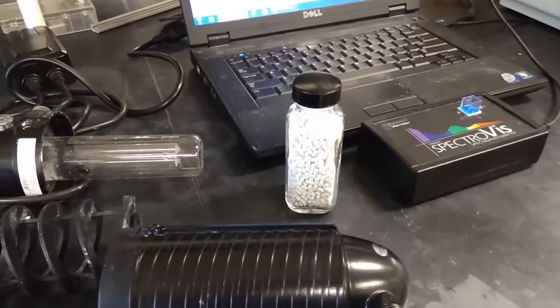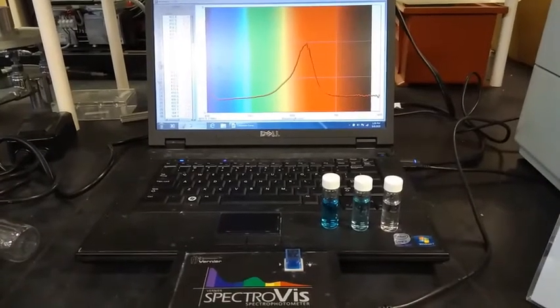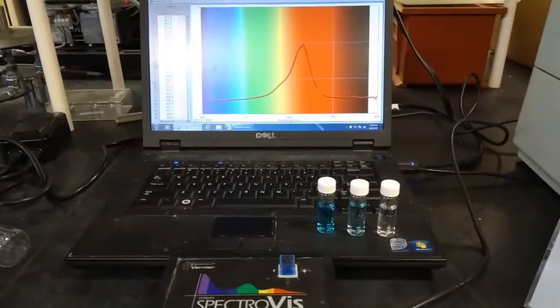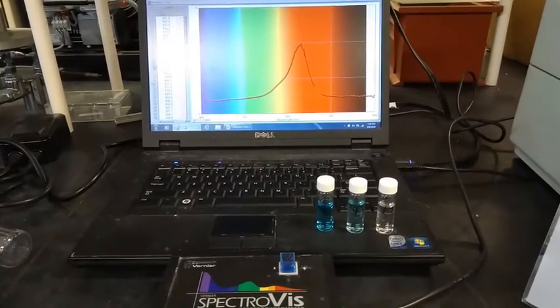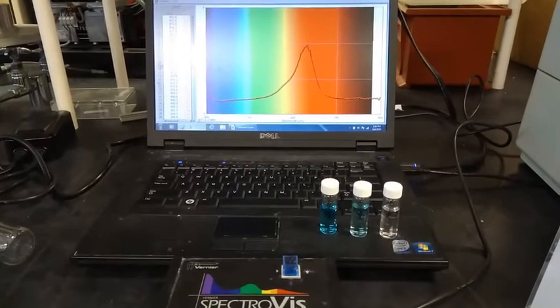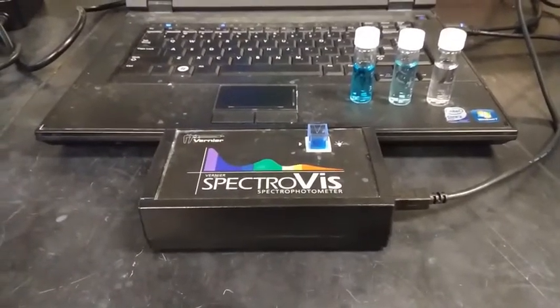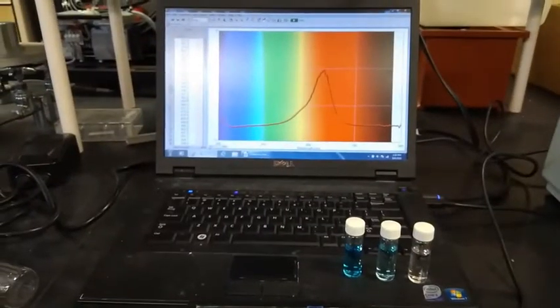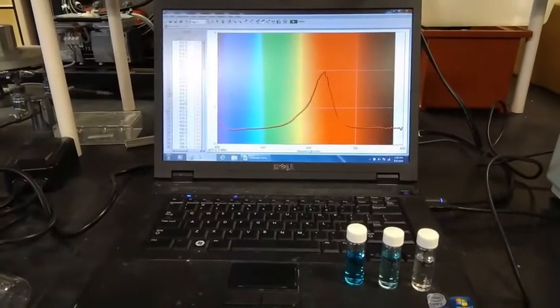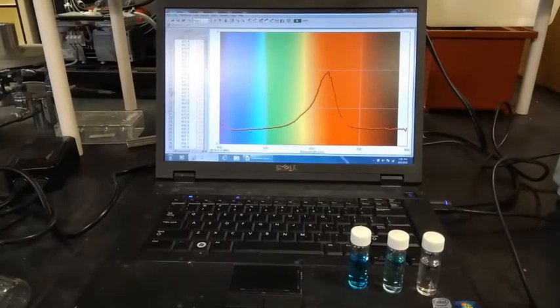In the back, we have a glass vial full of titanium dioxide, and the titanium dioxide is our catalyst for this reaction. We add that to the photocatalytic reactor. The last important part of this experiment is measuring the concentration of the solutions. We measure the absorbance of the solution using this spectrophotometer. On the computer, there is an absorbance curve with different wavelengths, and the absorbance maximum for this methylene blue solution is about 650 nm wavelength.